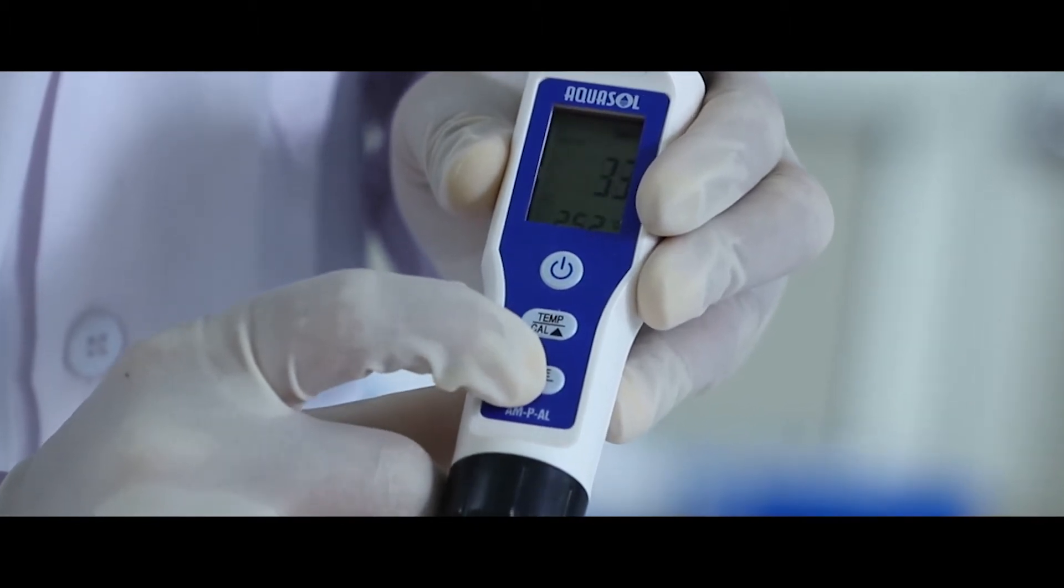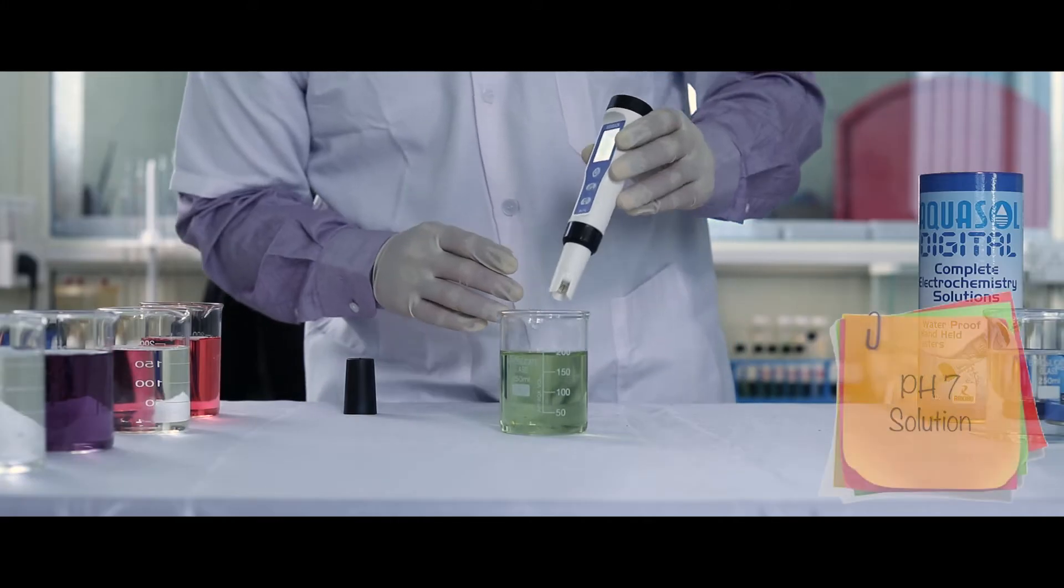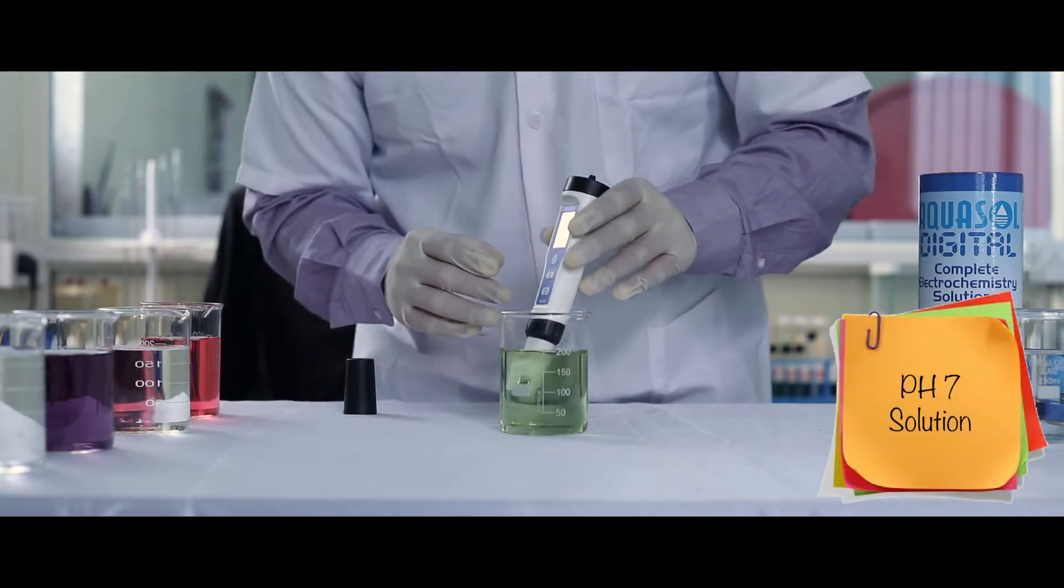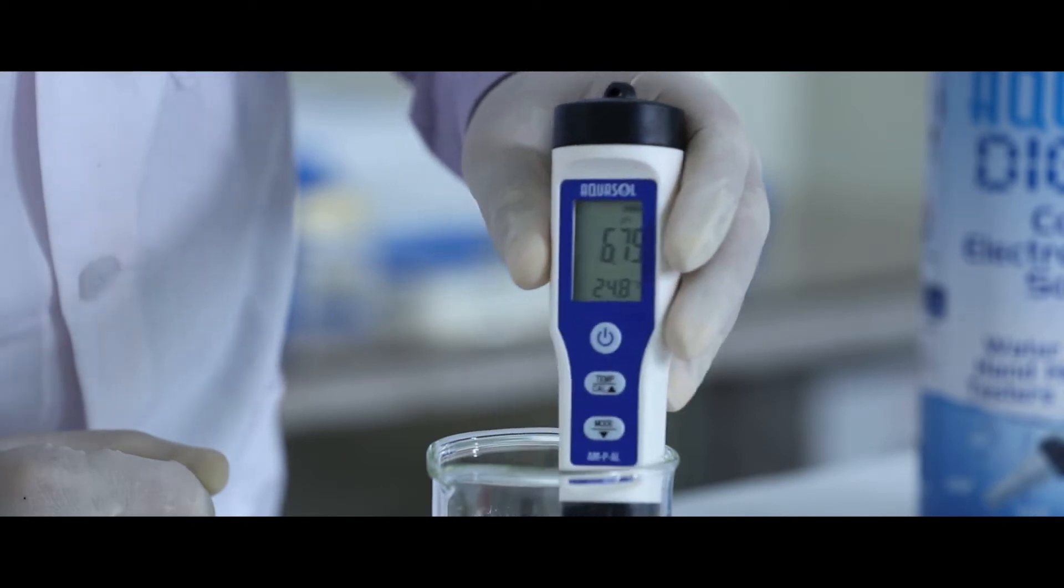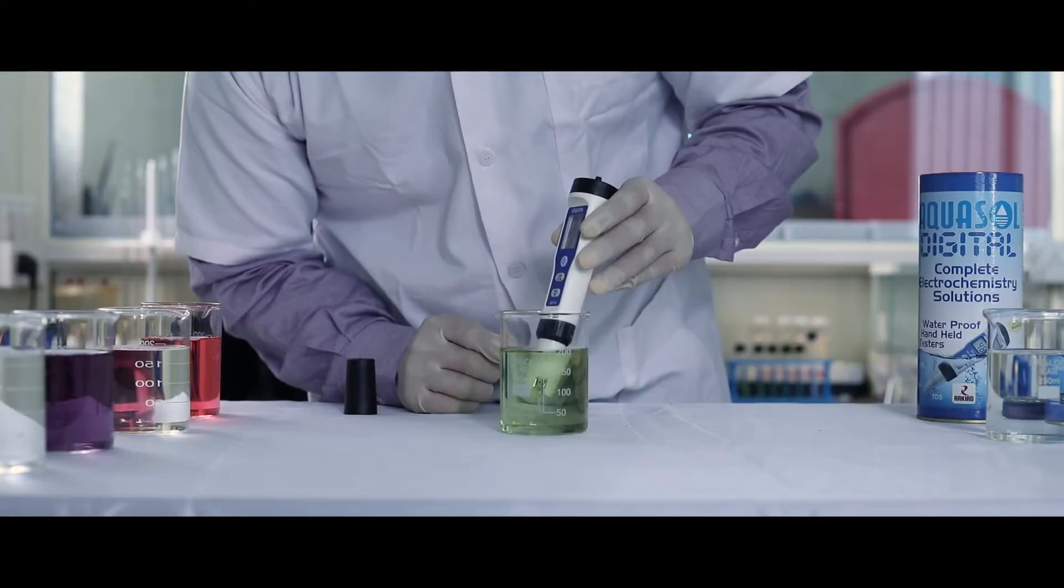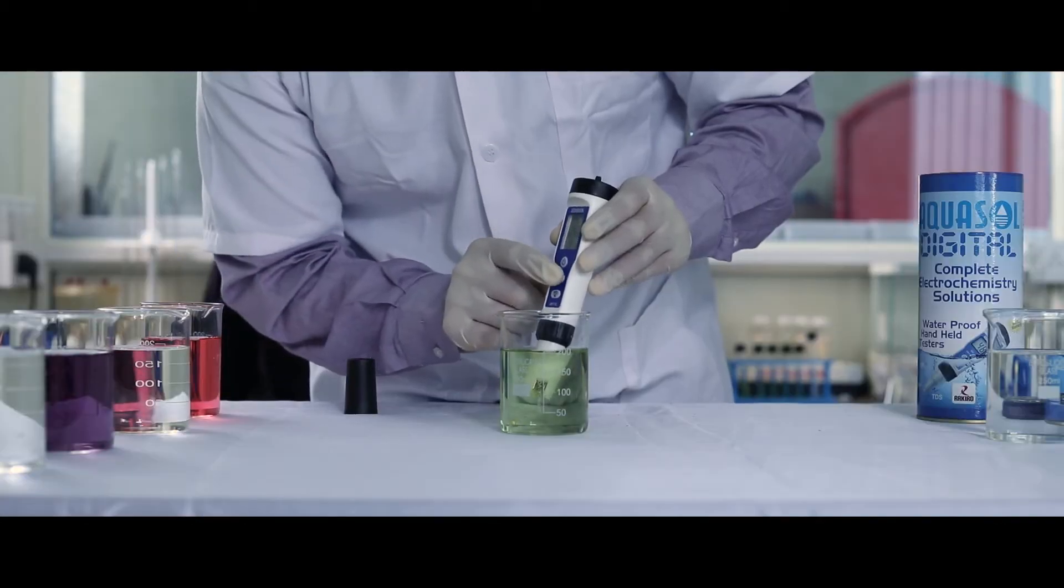Now let's calibrate for pH. Dip the electrode in standard pH 7 solution. Stir gently for stable reading. Press cal key to calibrate.